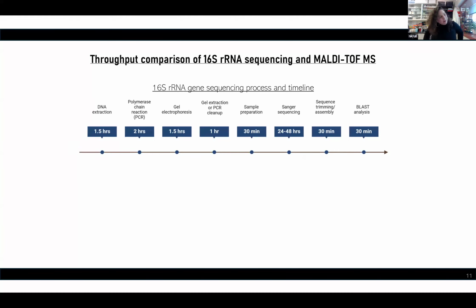And I can tell you, with a background in microbiology, I've extracted DNA from hundreds to thousands of bacteria. I feel very strongly that this timeline is best case scenario. So we start out with extracting DNA from bacteria. There are quick and efficient ways to do this, but many groups rely on kits for quality data. It could take around an hour and a half.